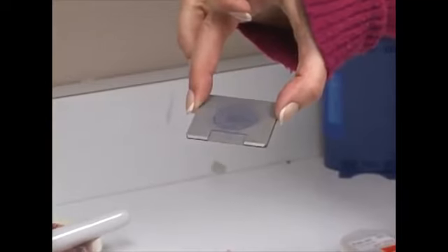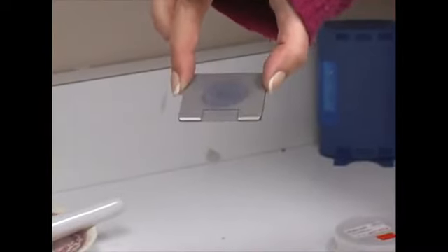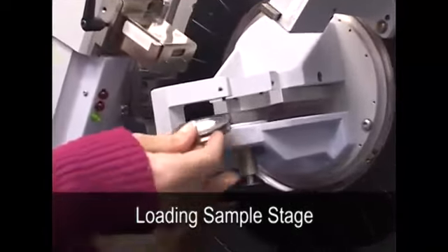Even though it's loose powder, if you've prepared it correctly, it will actually hold together on its own. To verify that you have that, just kind of tip it up at a 45-degree angle and make sure that it's holding. The sample stage is held in place with a pressure plate.